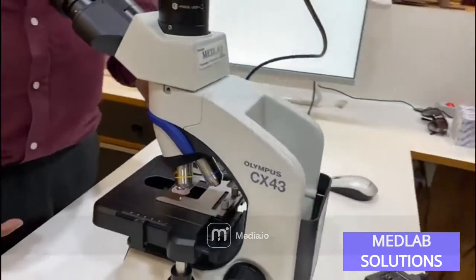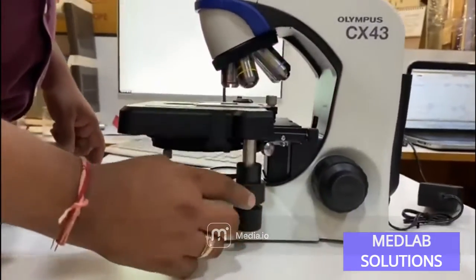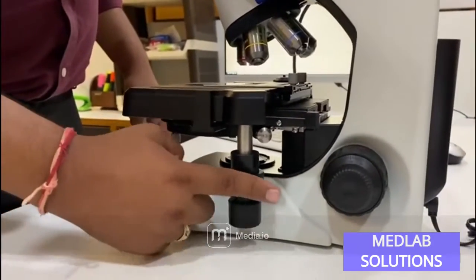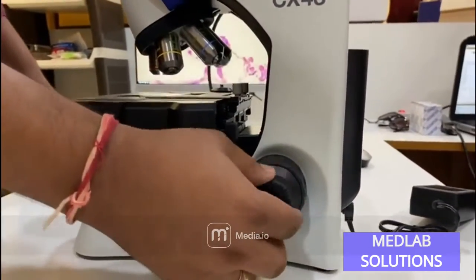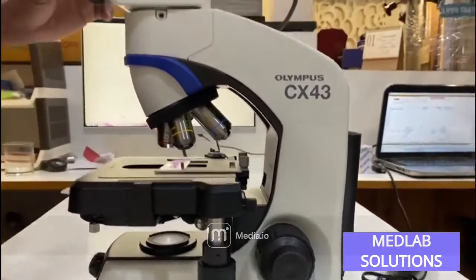You get a very ergonomically smooth stage with left-right and up-down movement via a string mechanism, so the stage movement is very smooth. You also get very smooth coarse and fine focus movement, as these are ergonomically designed microscopes built to US standards.